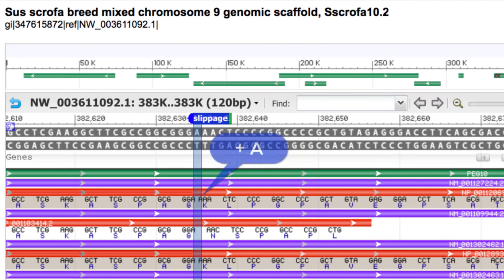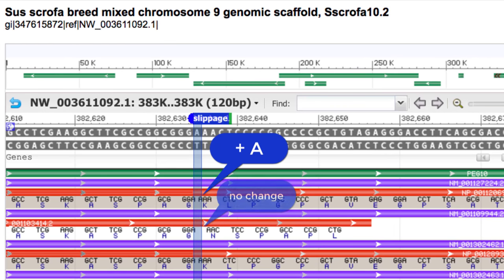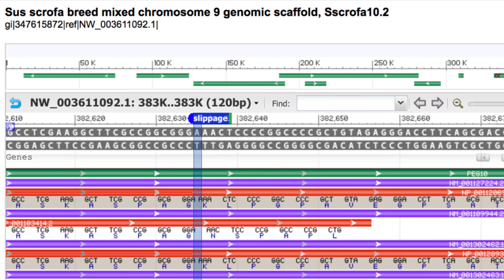Notice the addition of an A in the first transcript compared to the second one. As a result, the codons, beginning with AAA for lysine, are shifted to the left relative to those in the second transcript. See the position of AAC for asparagine.